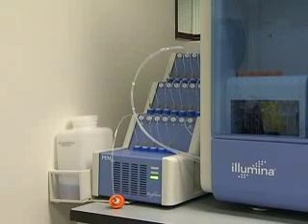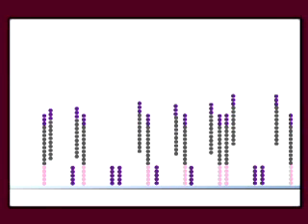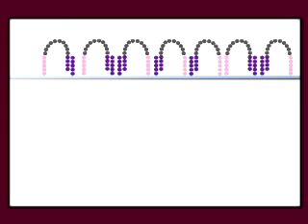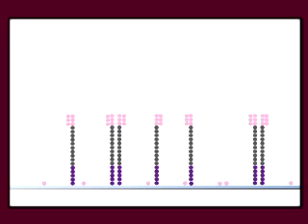Is that possible with Illumina? Yes, there is a machine that can be attached to the genome analyzer called a paired-end module. This acts like a small cluster generator to regenerate clusters for paired-end sequencing. After sequencing with one primer, the flow cell can be heated to separate the sequenced strand and then washed off. A few cycles of bridge amplification regenerate the other strand, and the first strand can be cleaved, denatured, and washed away. Then the sequencing can be repeated using a primer with a sequence that's complementary to the other adapter.